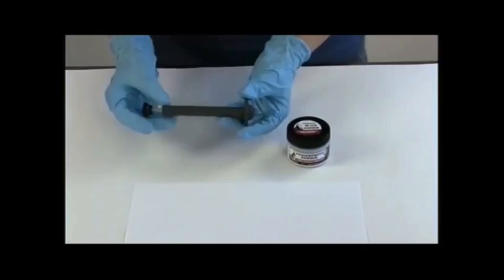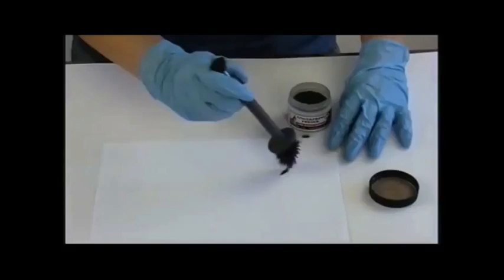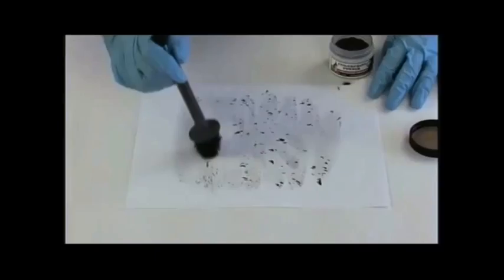The magna brush is a wand that uses magnetism to attract the powder. The powder is then spread around the area and it attaches to the fingerprints that are left behind because of the iron.